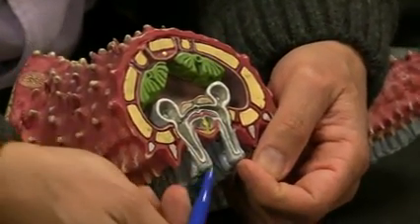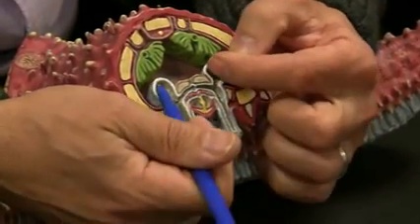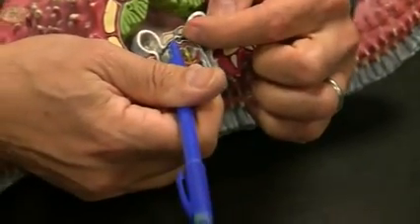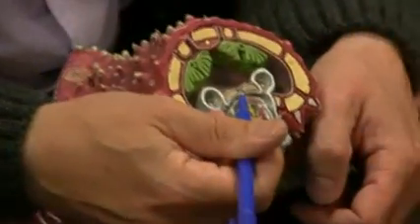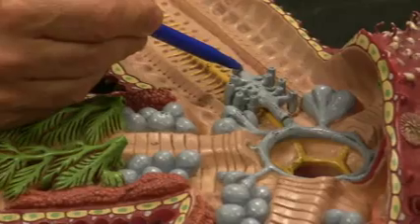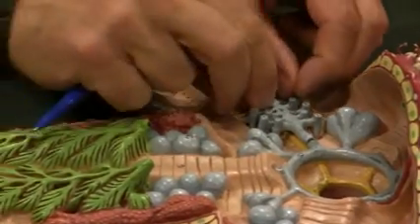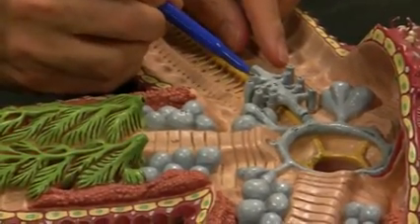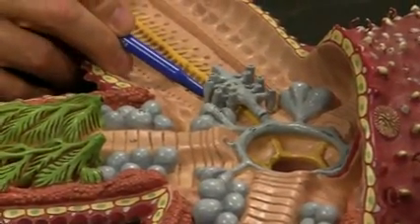These are tube feet. Water goes in here. The water from the tube feet goes into the ampulla, and also it can go to the lateral canal. You have one lateral canal here, one lateral canal here, and it goes to the radial canal. So these right here are your radial canal, and this would be the lateral canal. On top of this, they cut off the ampulla for you to show how the system works. So you have the ampulla on top, and on the bottom is a tube foot, which goes to the outside. Okay.